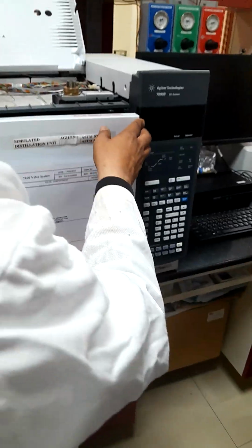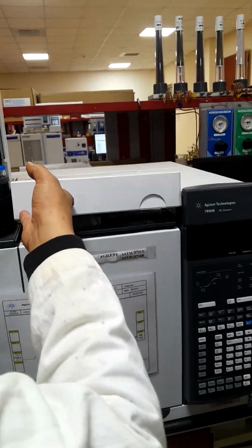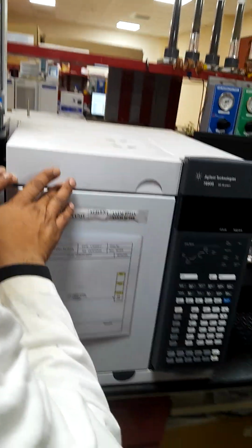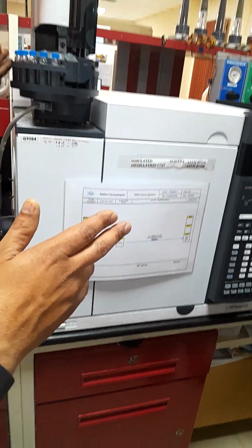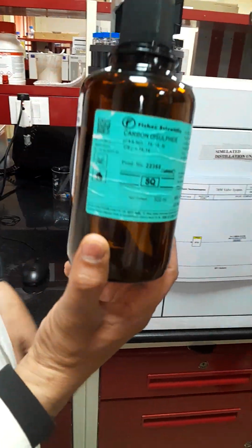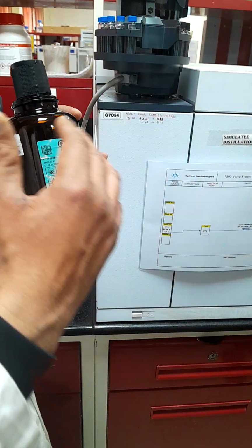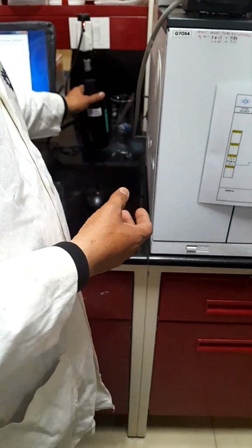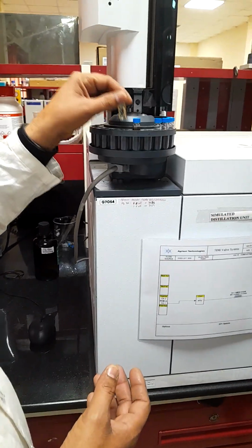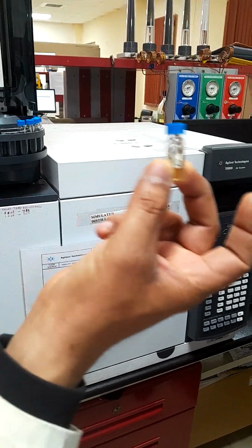Whenever you get a sample in liquid form, solid form, or gaseous form, you have to enter it from the inlet. So before entering the inlet, you have to dissolve it in CS2. So what is CS2? Carbon disulfide. CCl4, any solvent you can use to dilute and prepare your sample. So when you prepare it, the sample will become like this. This sample is a diluted sample of that one.